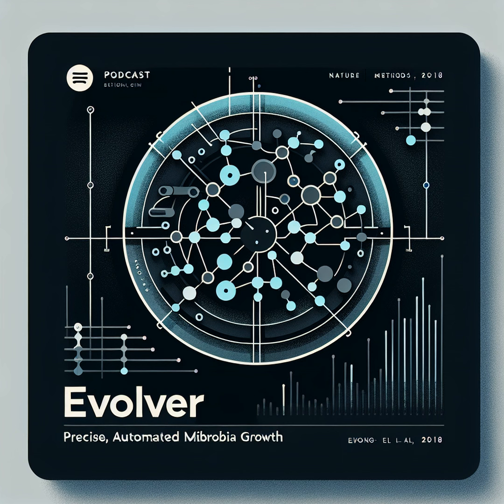And it's not just about solving individual problems, it's about the potential for entirely novel types of experiments. The ability to program complex interactions between different cultures, for example, opens up a huge range of possibilities that weren't feasible before. True. eVOLVER essentially enables a new level of experimental complexity and control. The researchers even demonstrated automated yeast mating. This shows the versatility and programmability of the system.